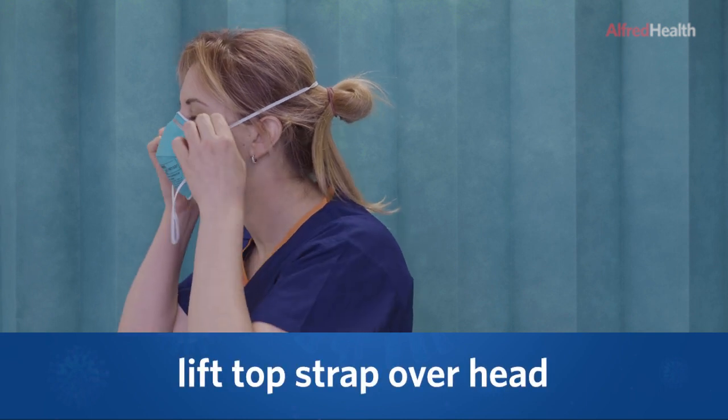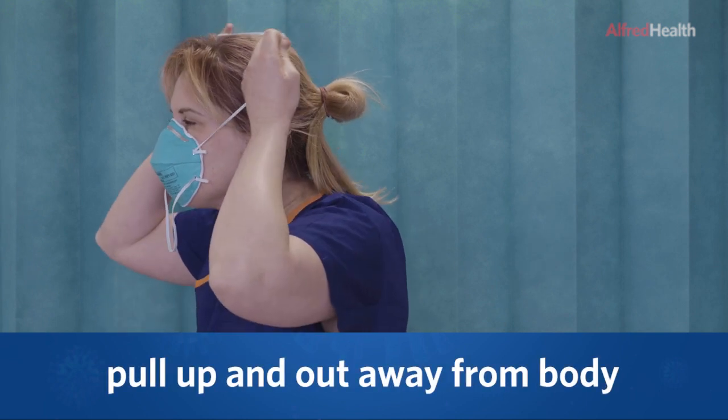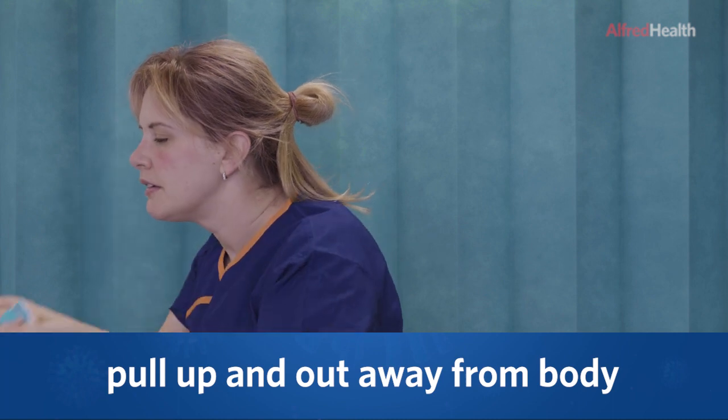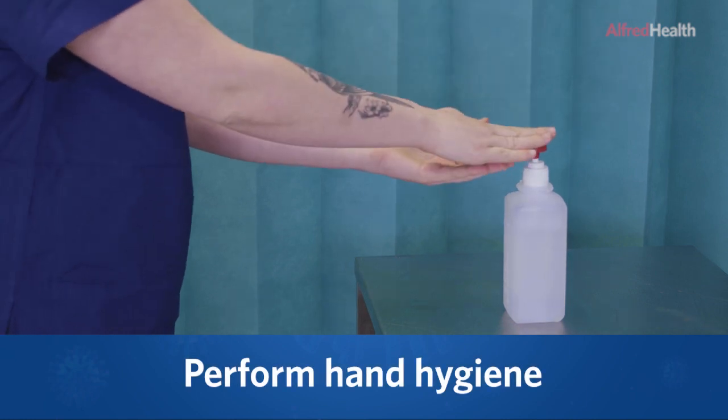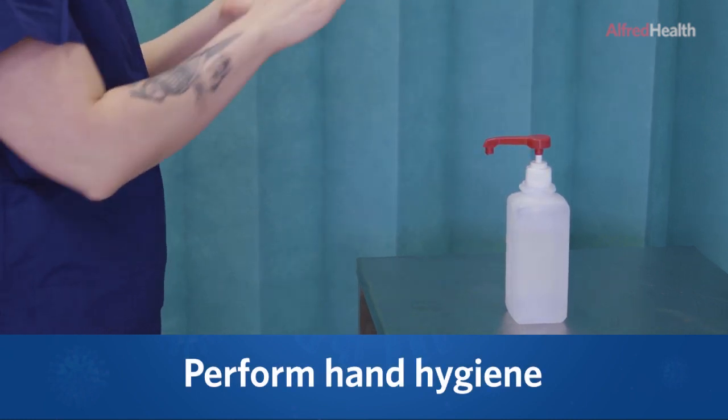Lift the top strap over your head, pulling the straps up and out away from the body. Dispose of the mask into the bin. Perform hand hygiene.